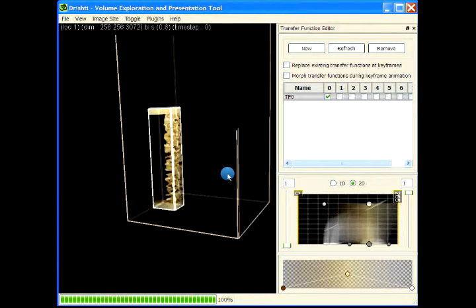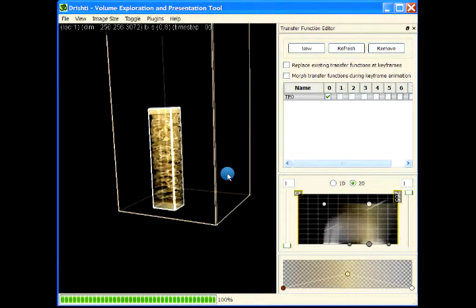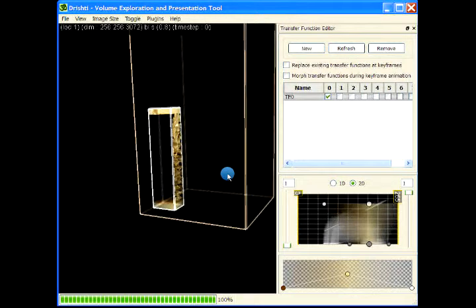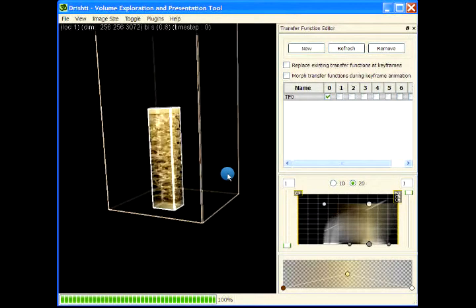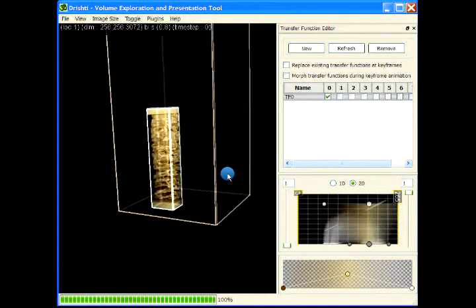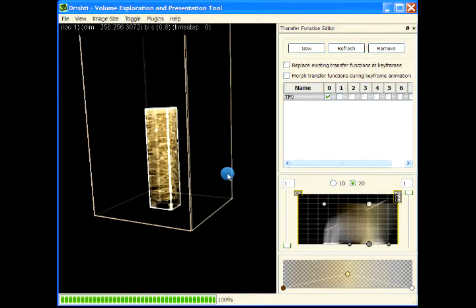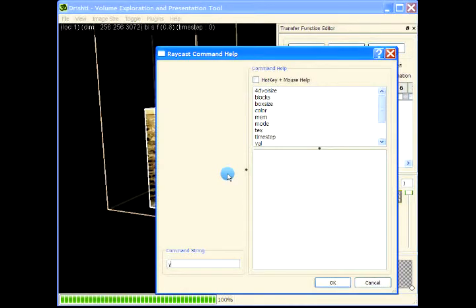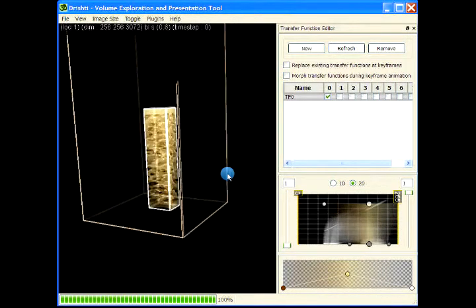Now you can change this step size, because what you can see is it's jumping from where the box ended. So you can change that jump, say X jump 0.5. So when I move this, it's taking half a step, and half a step is basically half the box size along the X direction. Similarly, if I want to do it for the Y direction, Y jump to say 0.25, so this is a quarter of the box size, so you can take finer steps.